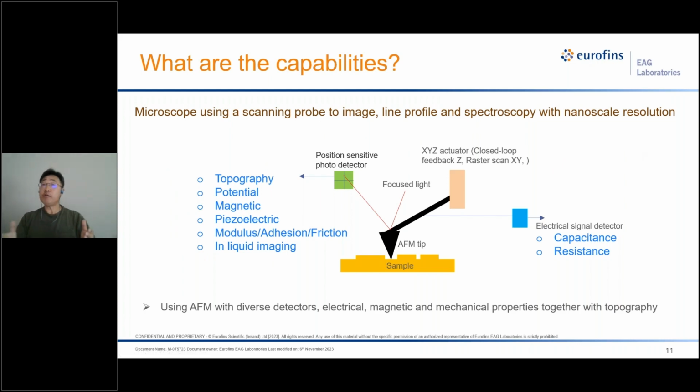The tip bending motion of the AFM tip contains mixed short and long-range force interaction signal between tip and surface. Using multiple filtering techniques, you can extract numerous interesting physical properties in addition to topography. You can, for instance, map surface potential to quantify work function among different materials. You can study ferroelectric properties in high dielectric constant materials. You can characterize magnetic domain distribution in hard disk data storage. You can even check modulus and adhesion in copolymer rigid materials.